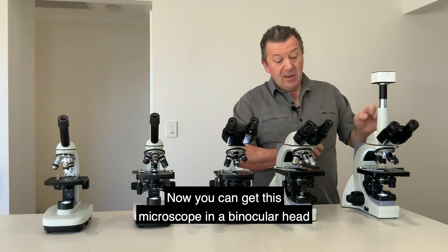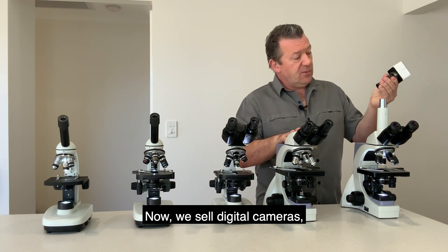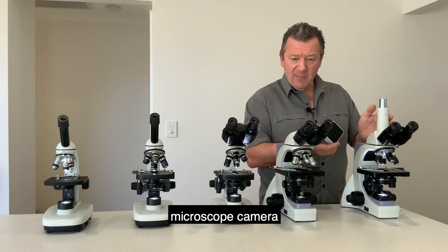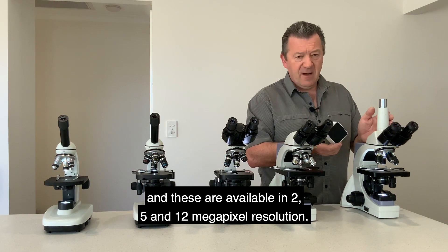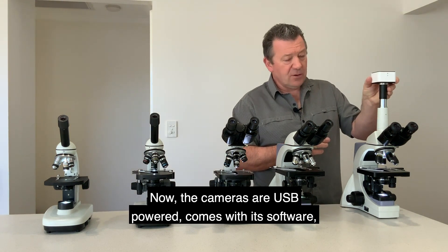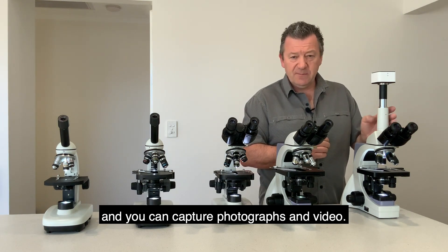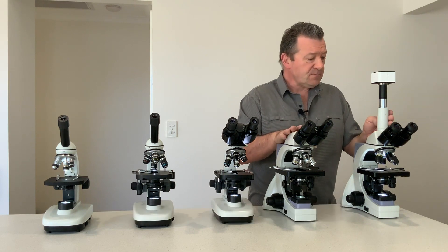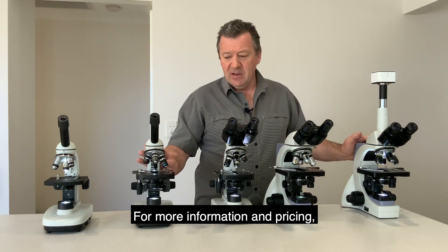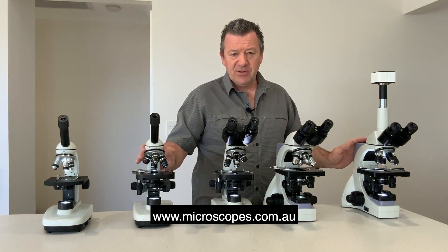This microscope is available in binocular or trinocular head configuration. We sell digital cameras and recommend the USB 2 microscope camera, available in 2, 5, and 12 megapixel resolution. The cameras are USB powered, come with software, and allow you to view your image on a computer monitor and capture photographs and video. That's a basic rundown of the Optico N-series upright biological microscopes — for more information and pricing please visit our website at www.microscopes.com.au.